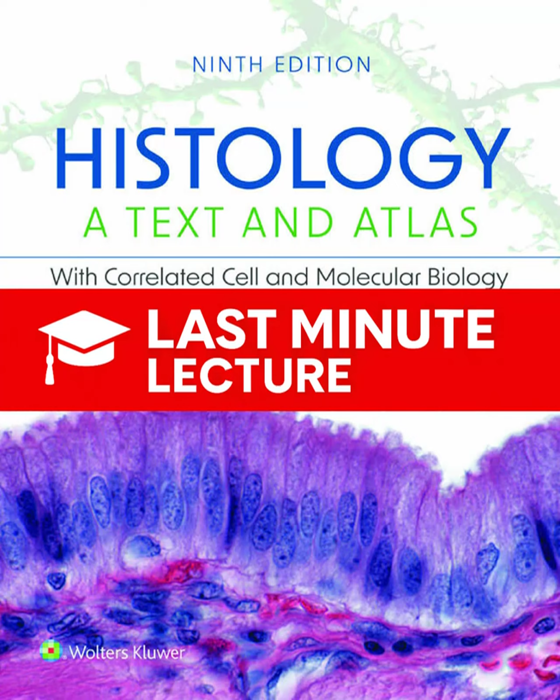Right. After you focus, the critical step is to adjust the field diaphragm. You close it all the way down, and then you focus and center the condenser until the outline of that diaphragm is sharp and perfectly centered in your view. And then you open it back up. You open it just enough to fill your field of view. The point is to make sure you're only illuminating the area you're actually looking at, which prevents stray light from washing out the contrast. And the final critical step involves adjusting the condenser diaphragm, which is where you manage that trade-off between resolution and contrast. This is where you strike the balance.